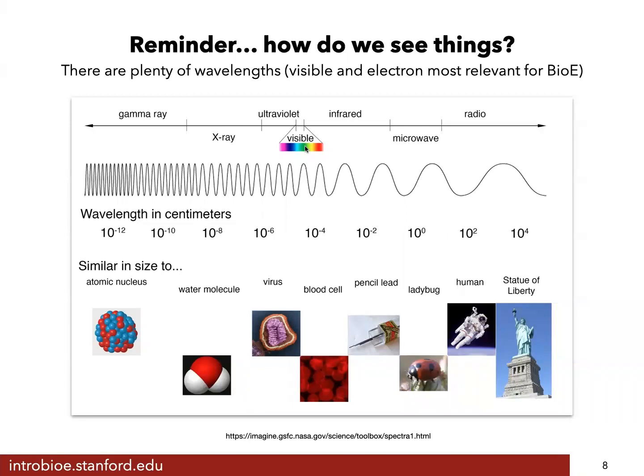So a different type of radiation and so a different wavelength. What's so interesting is the wavelength on an electron microscope is going to be way down here. If you come down to the bottom of the slide, you can see that the visible wavelengths are somewhere between, say, a virus particle and a whole cell, which means visible wavelengths on a light microscope are going to let us see microorganisms and some of the structures inside microorganisms.